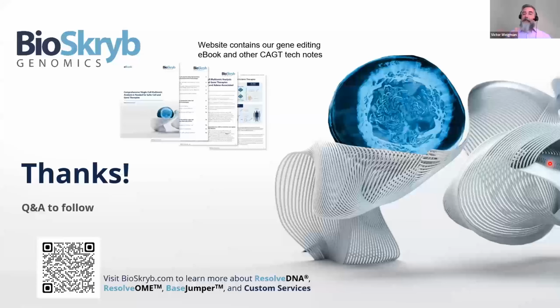Yeah, that would be great. That's why we added at the very beginning of the controls the bulk version of these cell lines, as well as individual cells that were both mock transfected and without the guide. So we used mutations or variants or alleles that were found in each of these to subtract out, including, as I mentioned earlier, the structural variants and the copy number. While it is not perfect, it's as good as the technology allows, so that what I'm representing in that cancer cell line is already taking the fact of it being a cell line and the variability of the molecular events. We're taking that out as much as we possibly can.